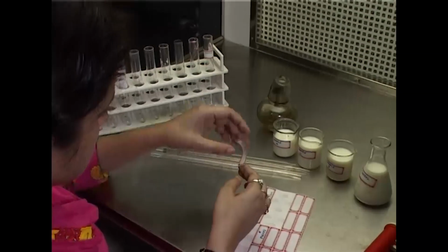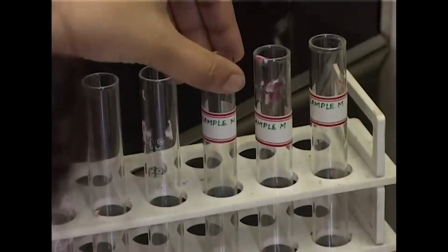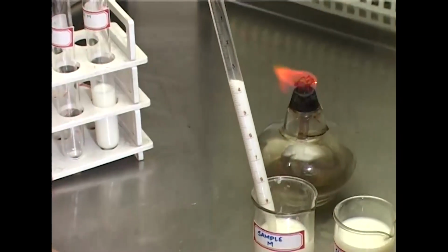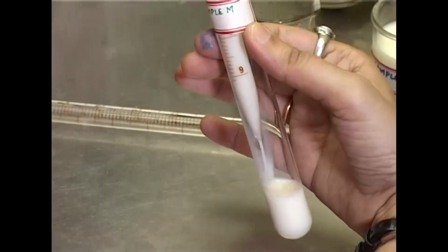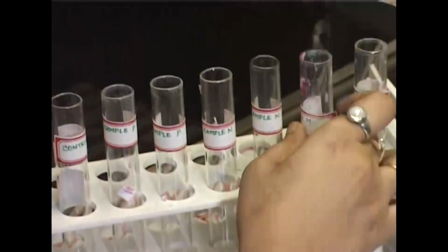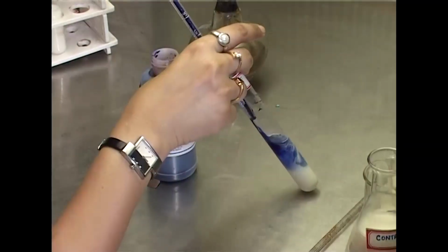First we take the sterile test tubes and label them sequentially. Now all these kinds of tests are generally performed in duplicates. That is, if we take the sample M, we are making duplicate samples of M. Similarly for N, similarly for P, and 2 for control. Using different 10 ml sterile pipettes, we are transferring the milk samples from the beaker to the sterile test tubes. Afterwards, we are adding 1 ml of methylene blue to all the milk samples.